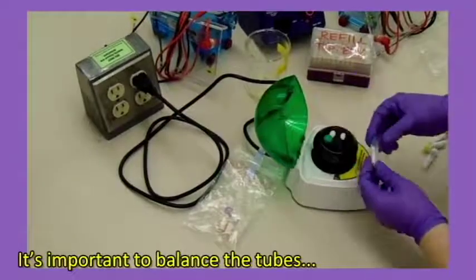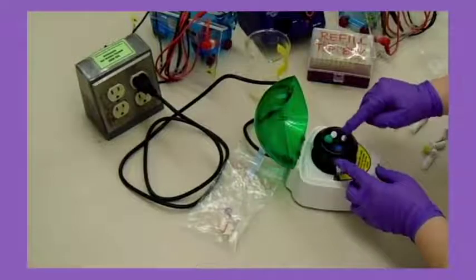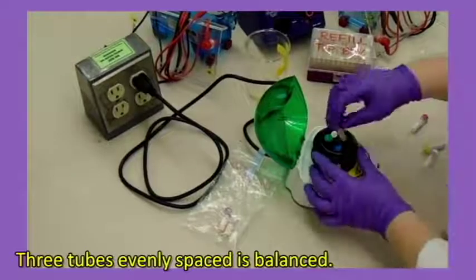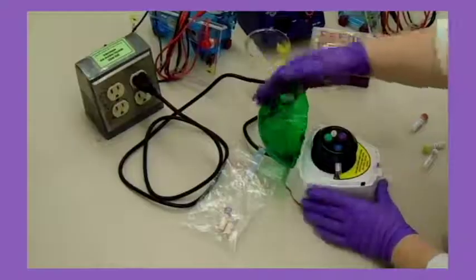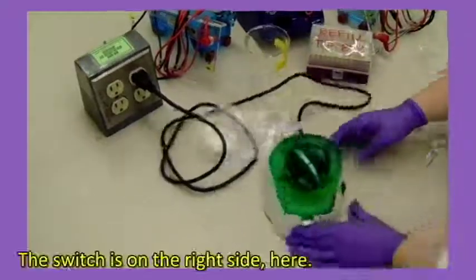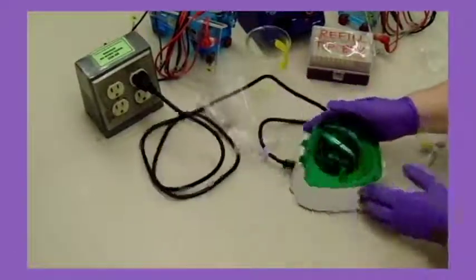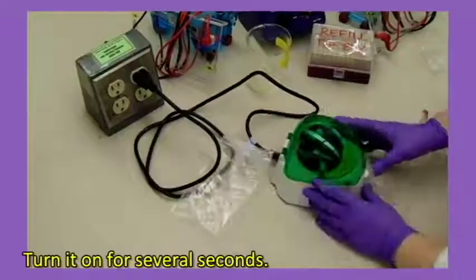It's important to balance the tubes in the microcentrifuge. Three tubes evenly spaced is balanced. The switch is on the right side here. Turn it on for several seconds.